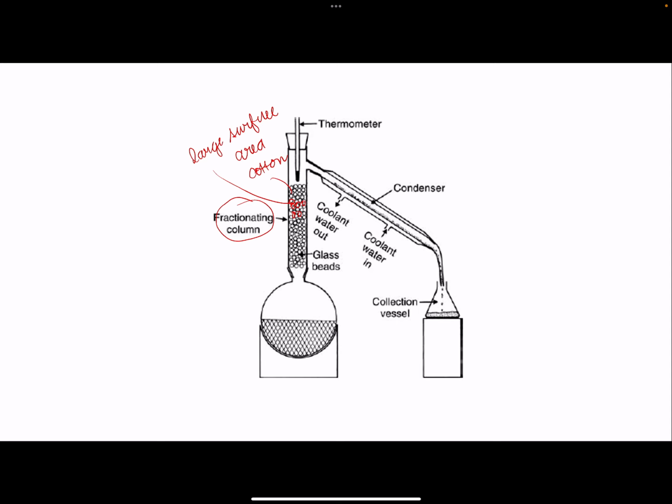Okay, what is the purpose of a fractionating column? So once our solution starts to evaporate, for example, meron kang solution na 73 degrees Celsius ang evaporation or ang boiling point, and then you have another solution that's 76 degrees Celsius. Okay? At a certain point, for example, umabot ka na ng 74 degrees Celsius, you're eventually going to evaporate or start vaporizing both. No? Nag-vaporize na si 73, nag-vaporize na rin si 76.